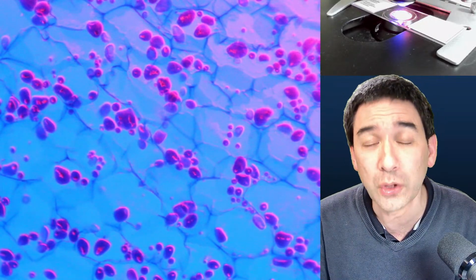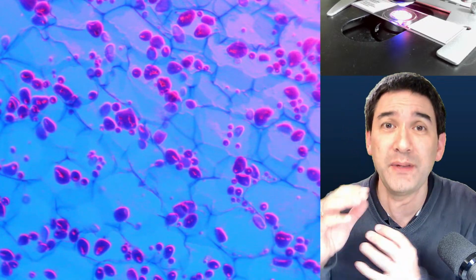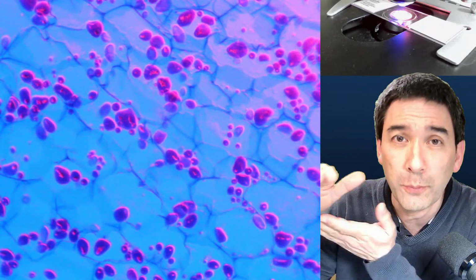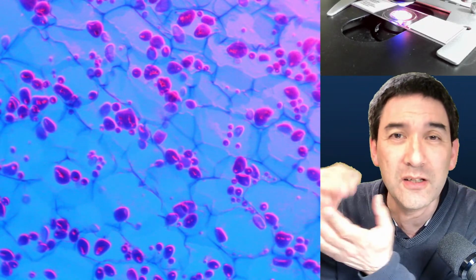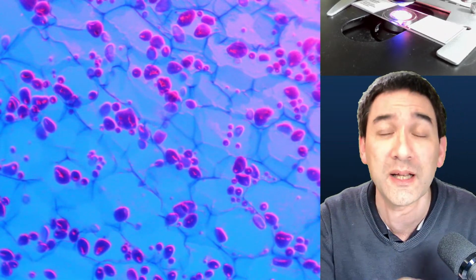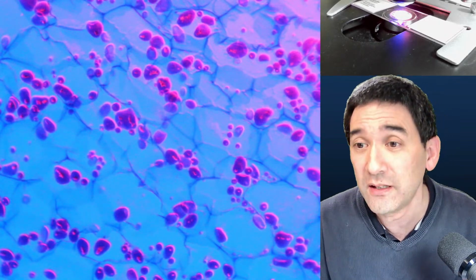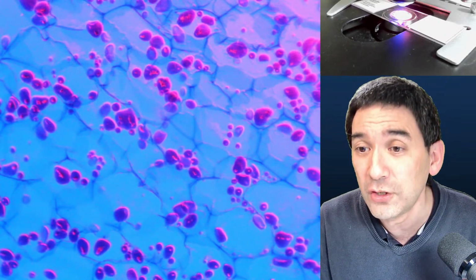I would probably say that if the filter is in air, with air on top and bottom, the heat is probably able to escape. But I have to admit, I was a little bit surprised how hot the filters became in a halogen microscope. So it is indeed a potential heat issue.